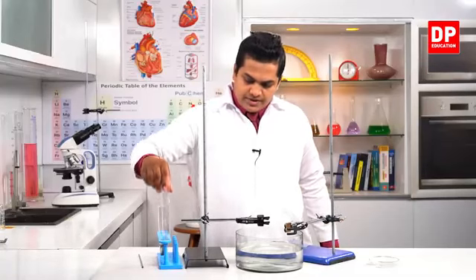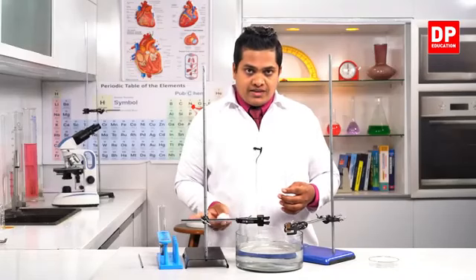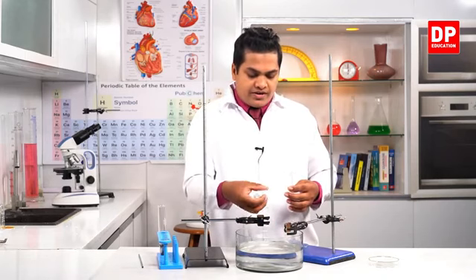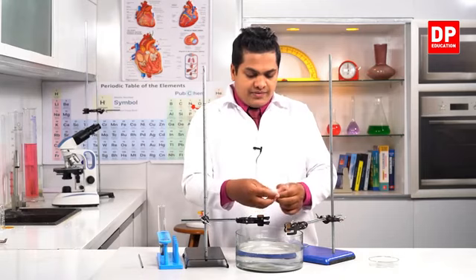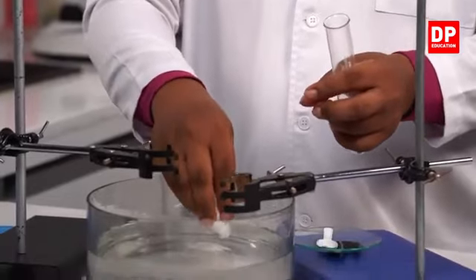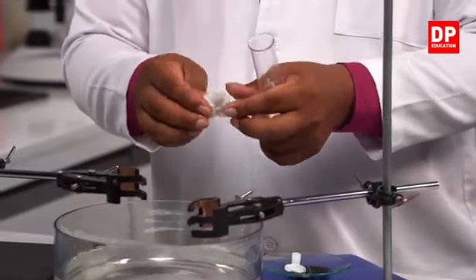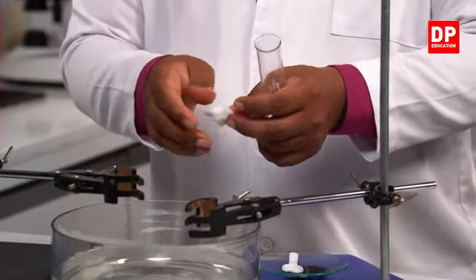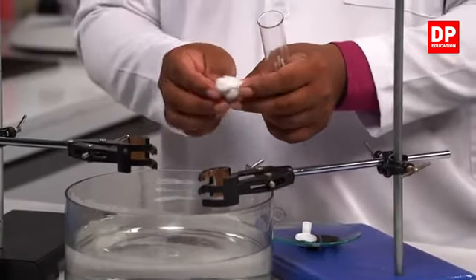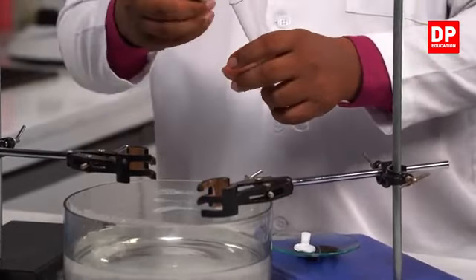I'm going to take the second test tube and take this cotton wool. Then once again, like in the previous one, I'm going to dip it in water and wet it to a certain extent. Then I'm going to insert this cotton wool into the boiling tube. Here we need to provide the same volumes to both boiling tubes. Remember it. That's why we are inserting the second cotton wool layer into the other boiling tube. Okay, so let's insert it.